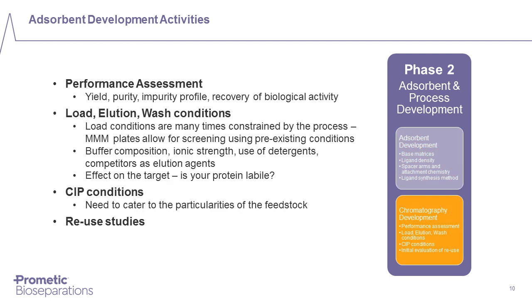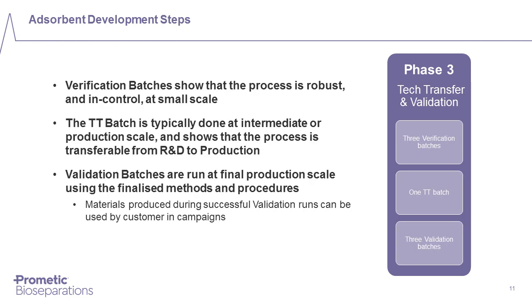As I said, at the same time in phase 2, we do work on the performance assessment for the adsorbent. What are the load, elution, and wash conditions that you would be likely to use, as well as CIP conditions, which are very applicable to your process, and also run reuse studies for the adsorbent.